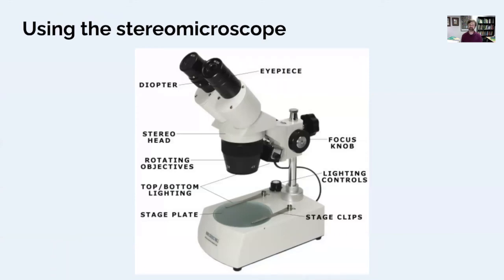Okay, so the last thing we'll do today is to explore the stereo microscope and use it to look for some differences among fruit flies. So we'll get to experience the fruit flies today. And this is similar, not exact, to the microscopes you'll have in the classroom. There will be a separate video that introduces you to our stereo microscopes.